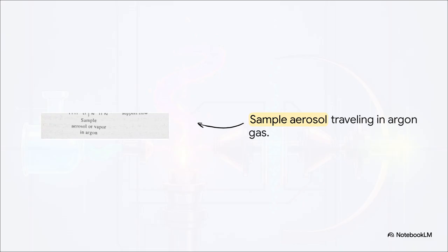When our sample aerosol enters this extreme environment, it is instantly dried to a solid, vaporized into a gas, atomized, and finally ionized into positively charged cations.